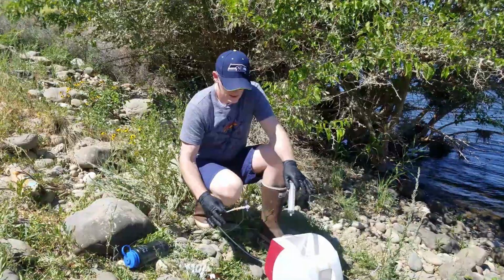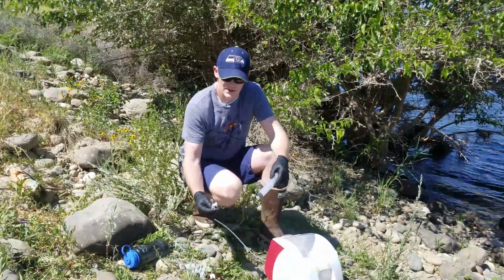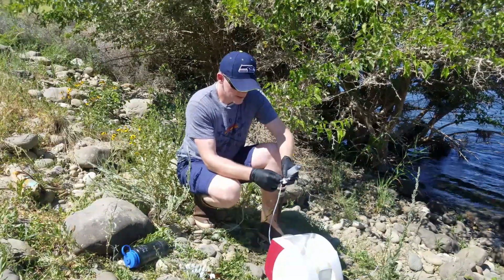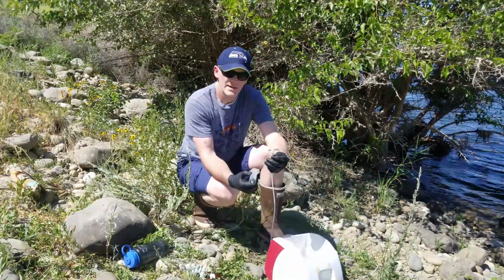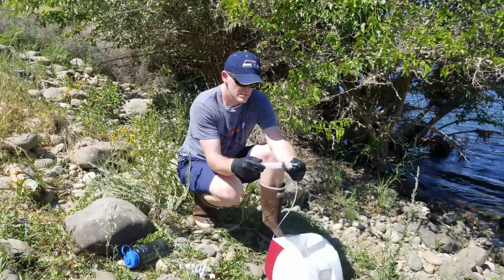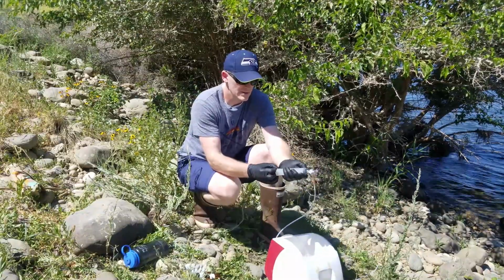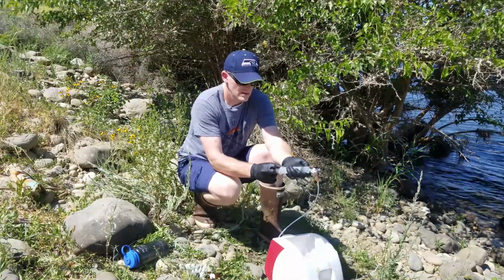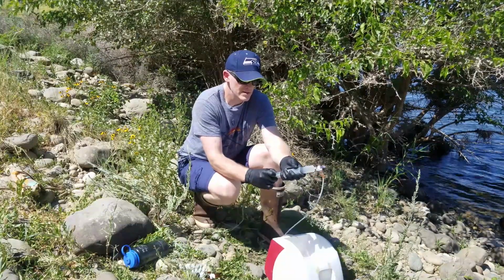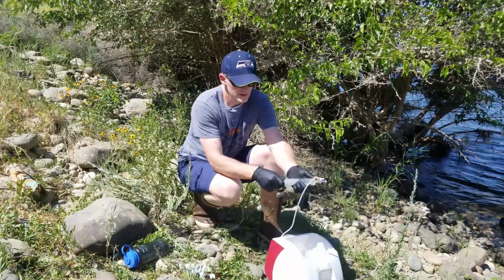So the point is, don't be having the stuff laying around like this just in the dirt and whatnot. That will contaminate samples. But in any case, the next move here is, this will be your next push point. You're going to take the same syringe that you were using before, attach it on, and then you're going to flush it three times, just as we've been doing. Because you're going to flush it three times, that's why it's okay to use the same syringe.